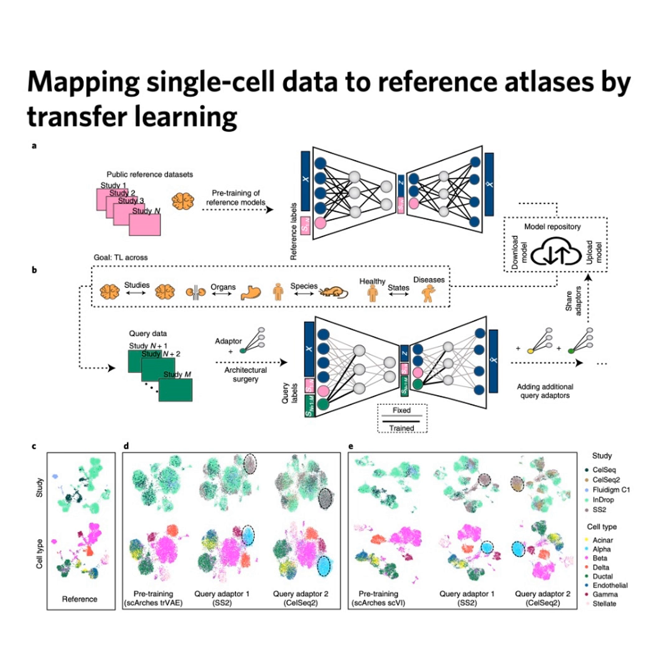For example, it identified a population of inflammatory macrophages that came from monocytes, we call them MOAMs, that were found almost exclusively in patients with severe COVID-19. And it didn't try to merge them with the healthy macrophages. Nope. It placed them as a distinct group close to the monocytes in the reference, correctly reflecting their developmental origin. It discovered a disease-specific cell state.